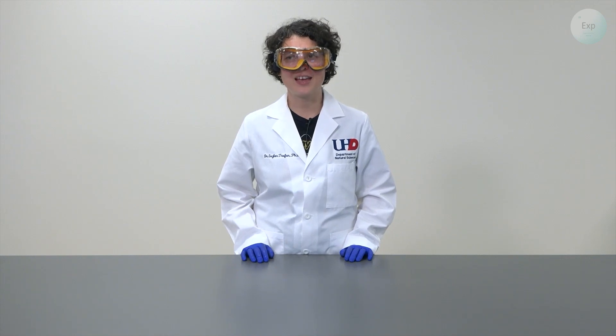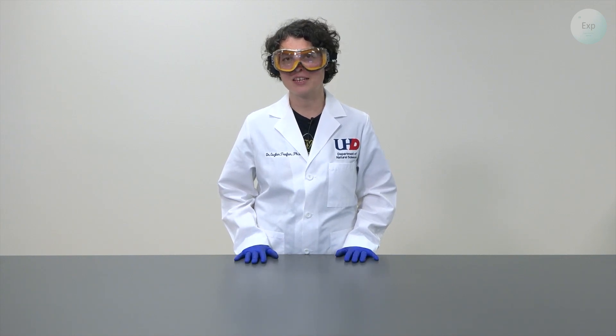Hello, my name is Dr. Esther Trufan, and in this video, I'm going to demonstrate a thermochemistry experiment that we can use to determine the enthalpy of fusion of ice.